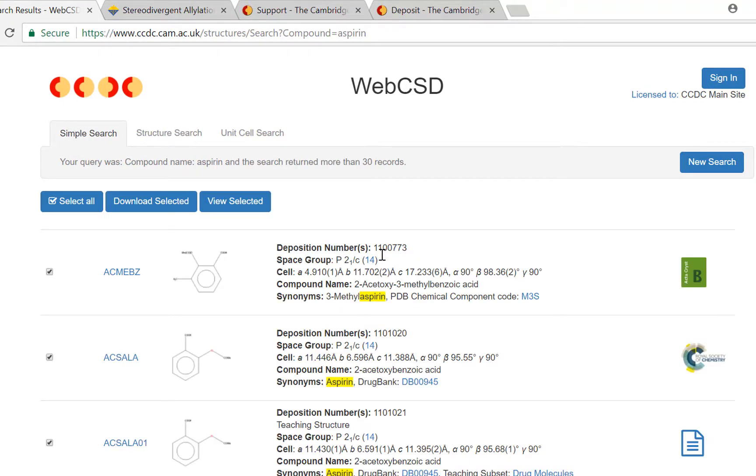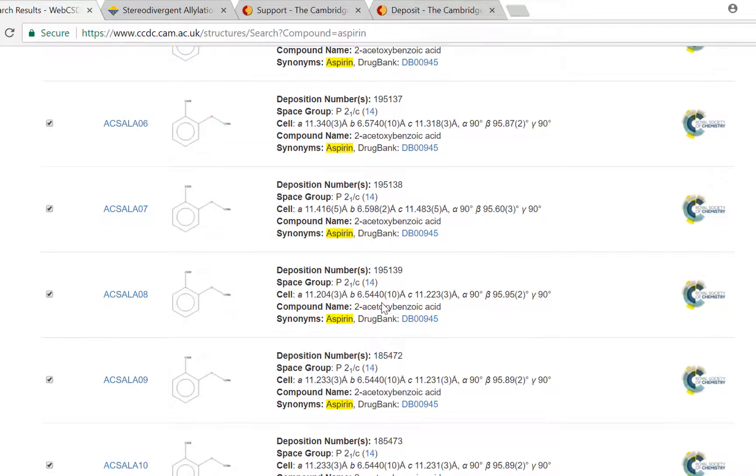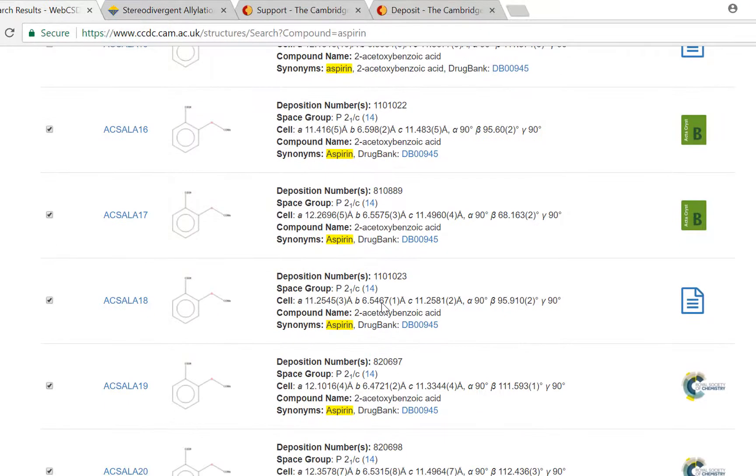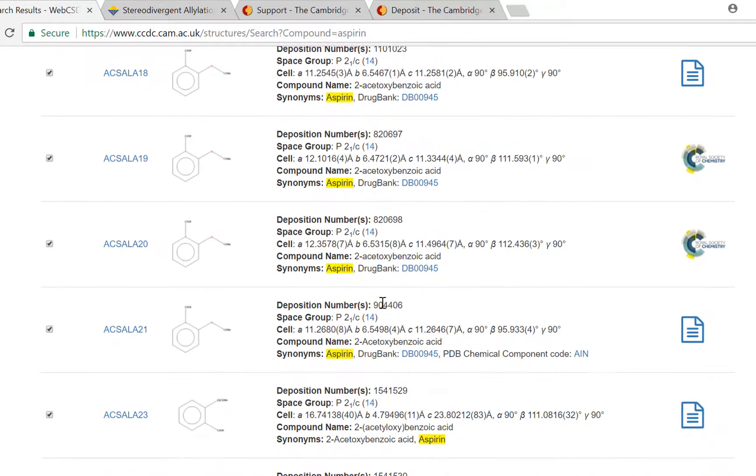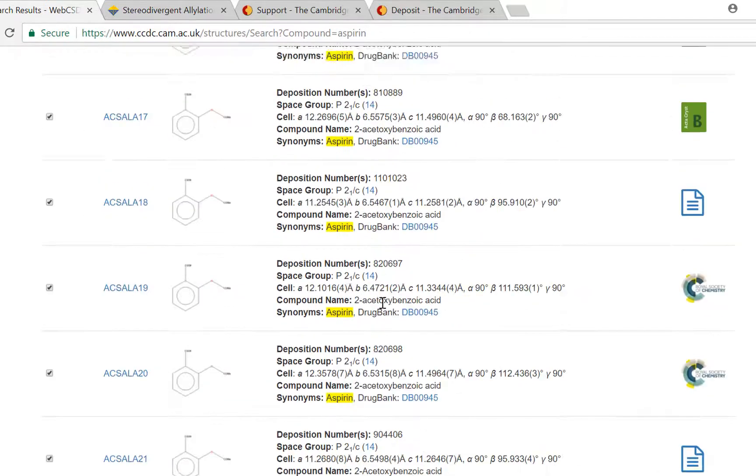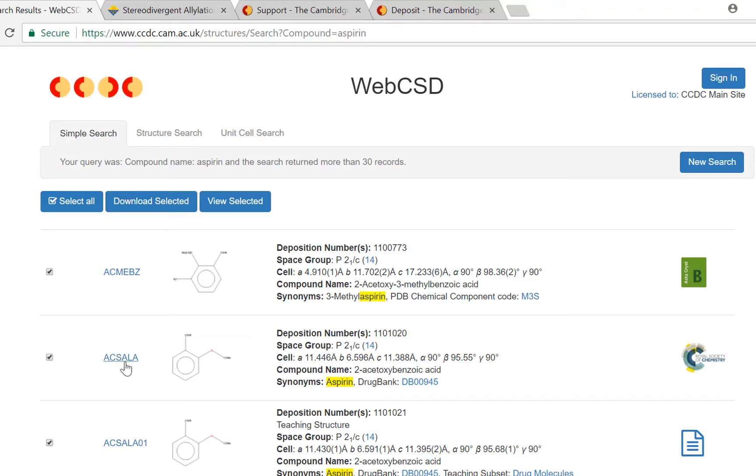On this results page you can see the first 30 results for any structures that have the word aspirin in their compound name. I would like to see more information for the compound with the refcode ACSALA because I can see from the compound name that this is pure aspirin rather than a derivative.